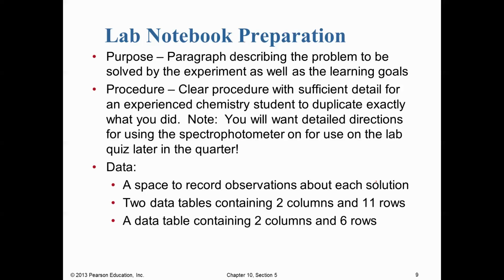All right, so let's talk a bit about the lab notebook preparation. It's similar to some of the labs we've done in the past. I want you to write a brief purpose section. This purpose section is going to just briefly describe what the goals of the experiment are. So what's the problem we're trying to solve here, as well as what our learning objectives or learning goals are here. And so if you give the procedure document a good look over, you should be able to identify these pretty clearly.